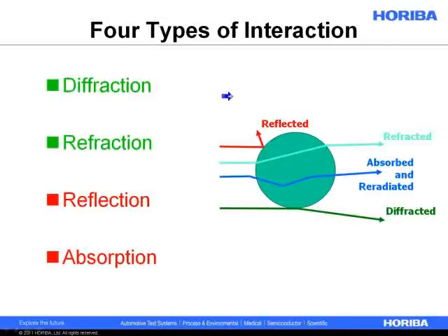Now we have a few ways to counteract that. The Mie scattering theory gives us something called an imaginary component of the refractive index that we can use to help correct for these poor light interactions. Not really a great term, but it gives us a tool to correct for it.